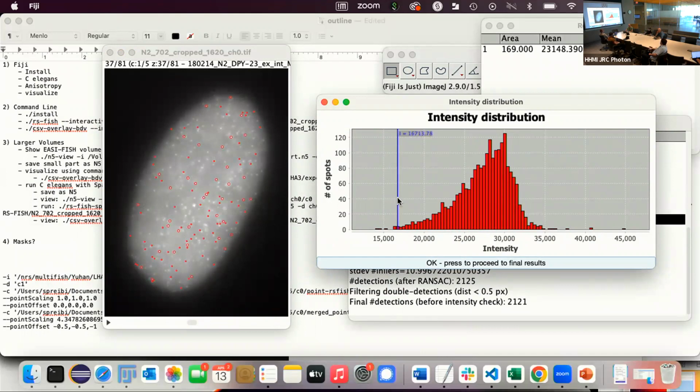So what would you do to the original image to ensure success? Like, do you need a sufficient SNR or flat field correction to get better, more accurate results? Sometimes we do this, yeah. We basically compute a big median or Gaussian filter and subtract that, which can help. Deconvolution beforehand usually can introduce artifacts. It depends. If you deconvolve slightly for a few iterations, it can help, because you highlight these spots more, but you have to be careful, it can get very Poisson-y, right?